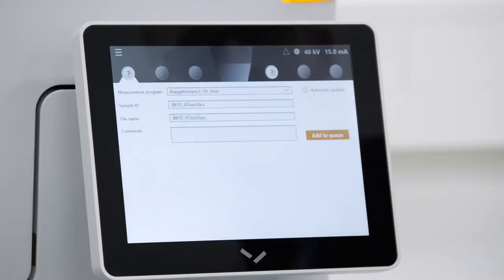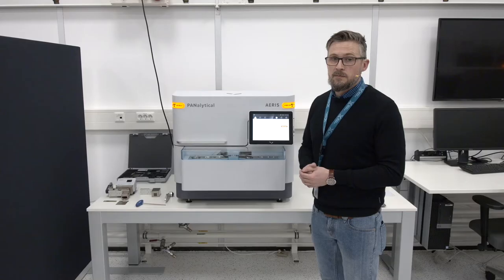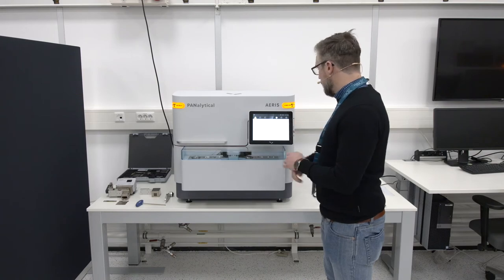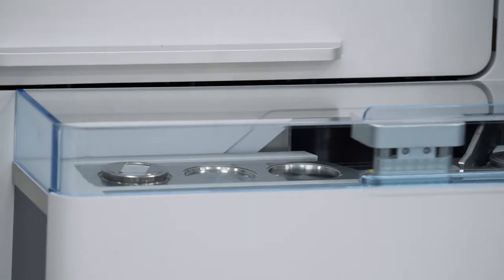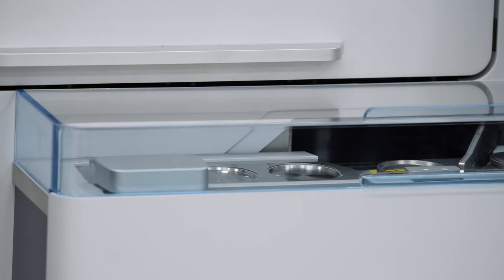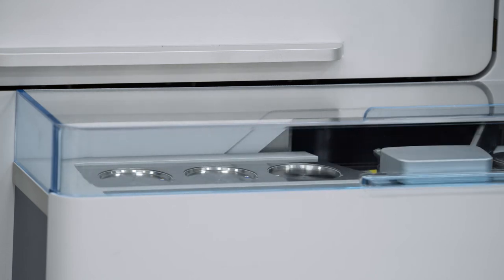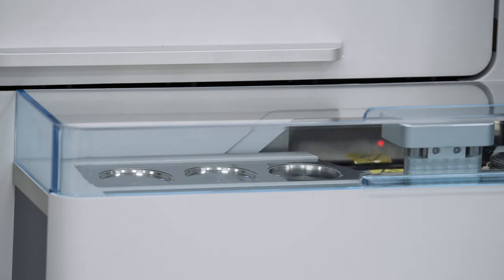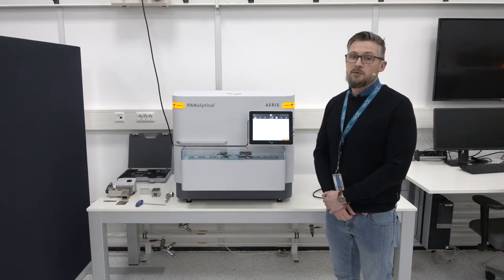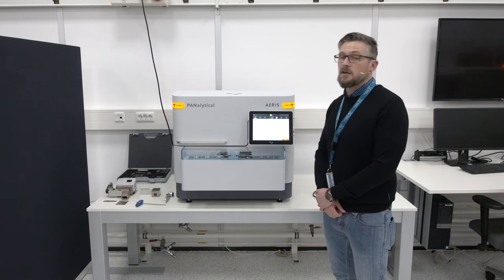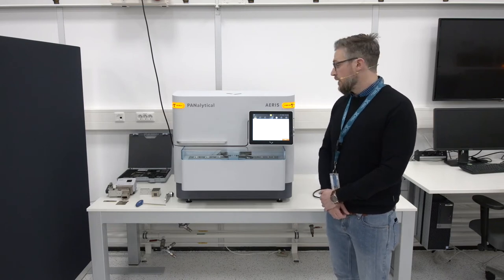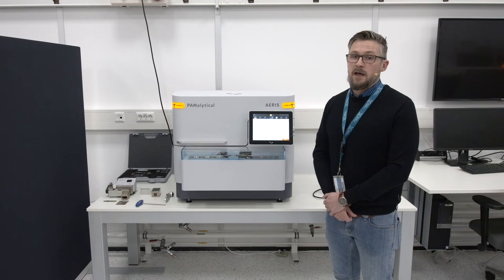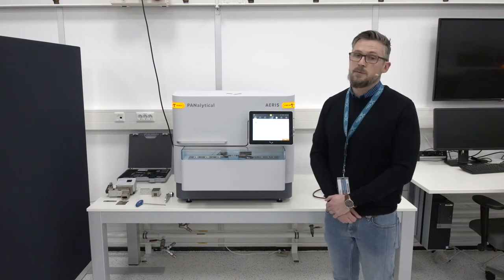I have pre-prepared a Bragg-Brentano measurement that is roughly two minutes long and will simply start it. The sample is picked up by the sample gripper, put onto the sample loader, and then introduced into the system. The whole user interaction with the instrument happens outside of the instrument, which means the user does not have to access the inside of the system at all times. This prevents contamination and also makes the life of the user much simpler.